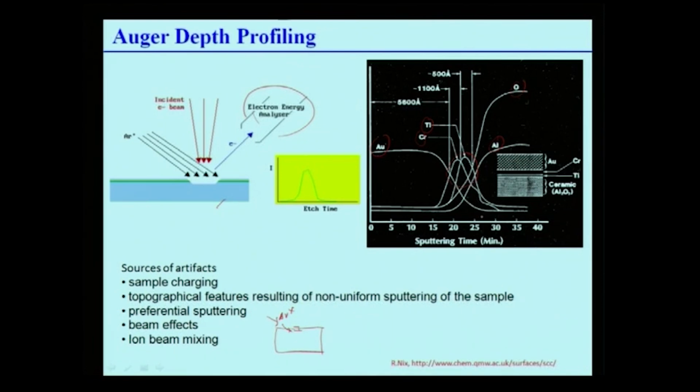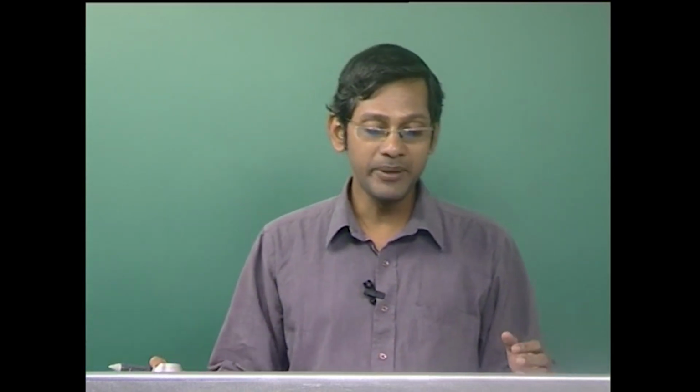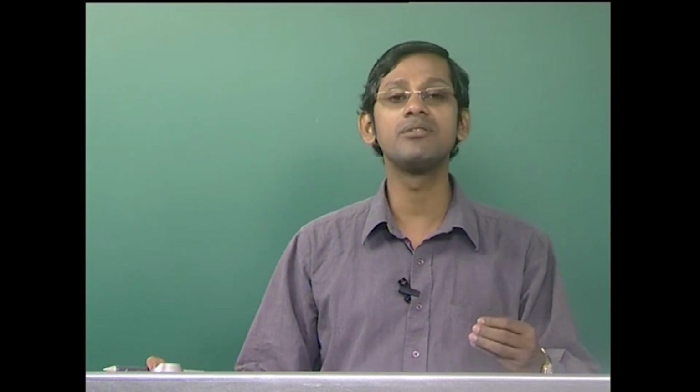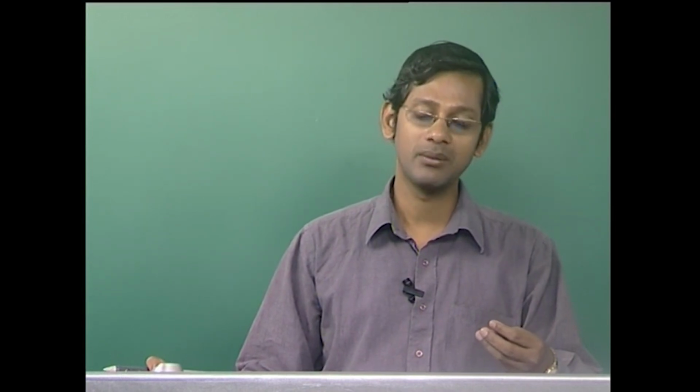So what does it mean? This is a very important aspect which you must know. This is actually required in material science. That means that although this is a very sensitive technique, it can be used to even do such fine scale depth profiling by using argon ion sputtering.